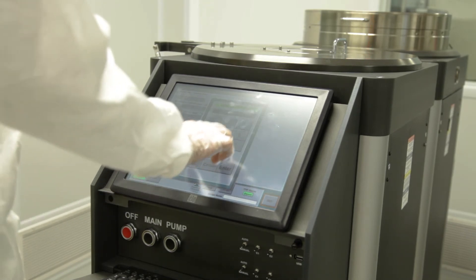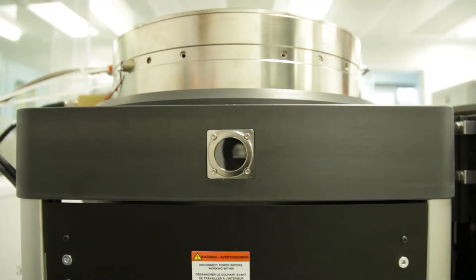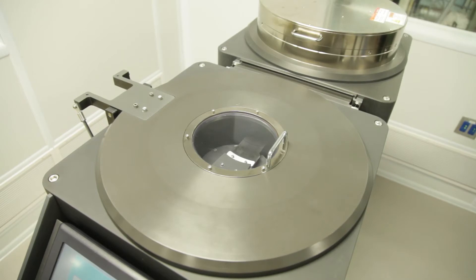The etching rate for a certain material depends on several factors, most importantly the type of gas you use to make the plasma. Gases with fluorine, for example, are good at etching silicon-based materials, where gases with chlorine are better at etching metals. Nanofabrication Kingston has both of these types.